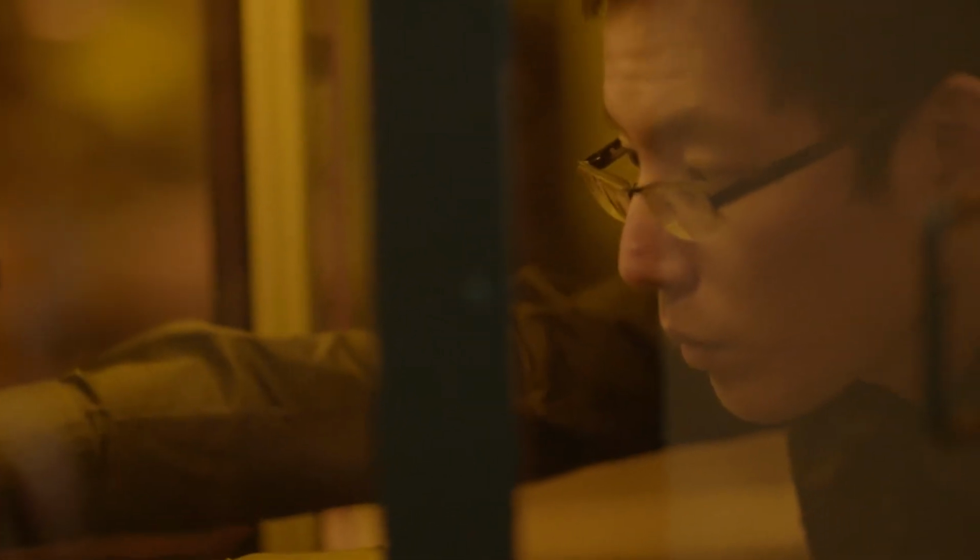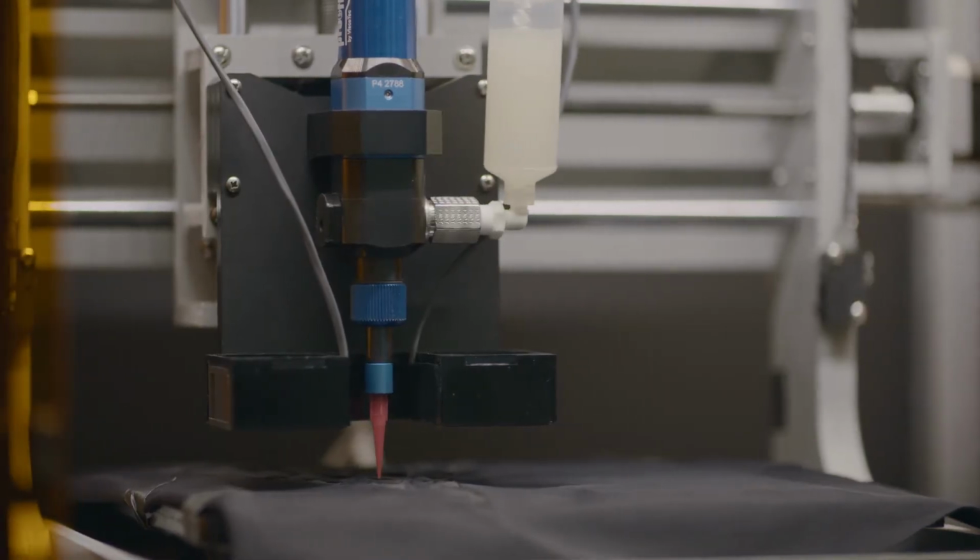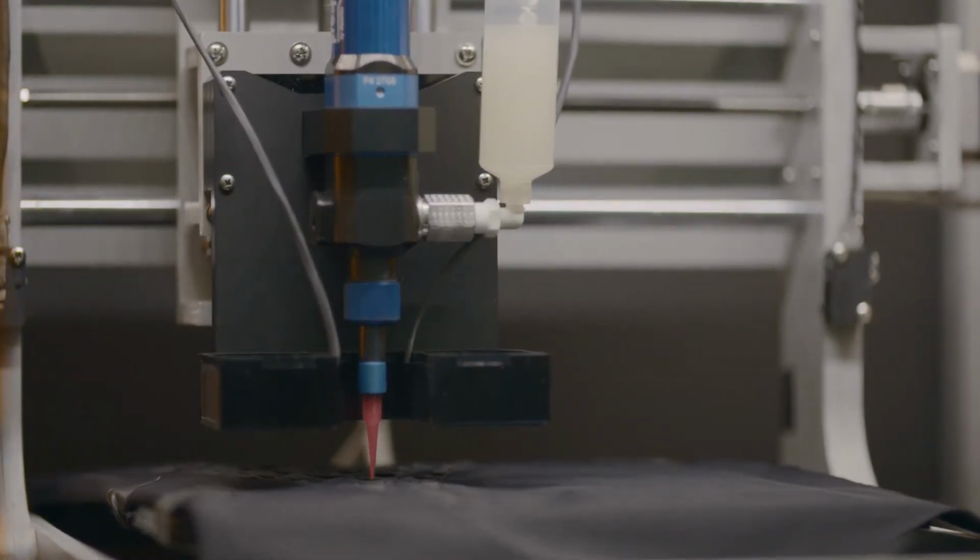We create our biohybrid film through a printing process. With the micron printing resolution, we are able to align the cells along a certain orientation. The alignments create a hierarchical structure which helps us to program the specific transformational behaviors that we hope.